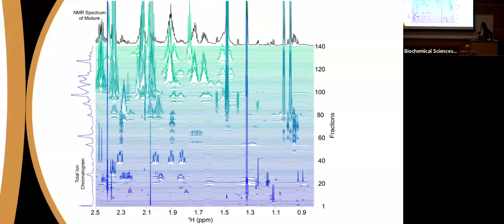And I'll highlight a few different regions. So if you look at, for example, the peak right here in box 1, nice sharp set of multiplets, totally obliterated by whatever is up here. You would never see that in a 1D spectrum. You might see a little hint that there's something, you're not sure what it is, but you would not see that. But this is a beautiful, separated, nice looking molecule, whatever it is.